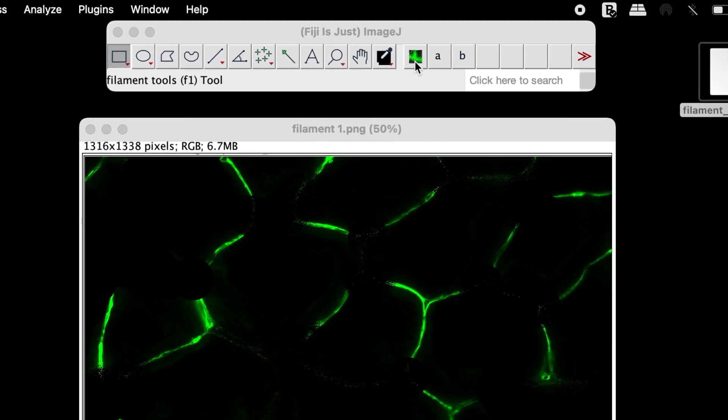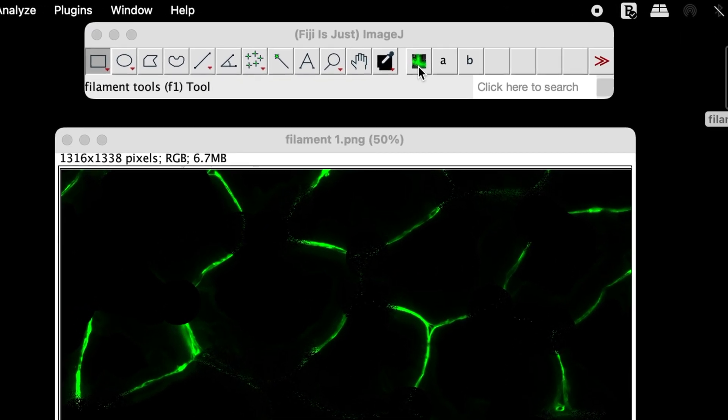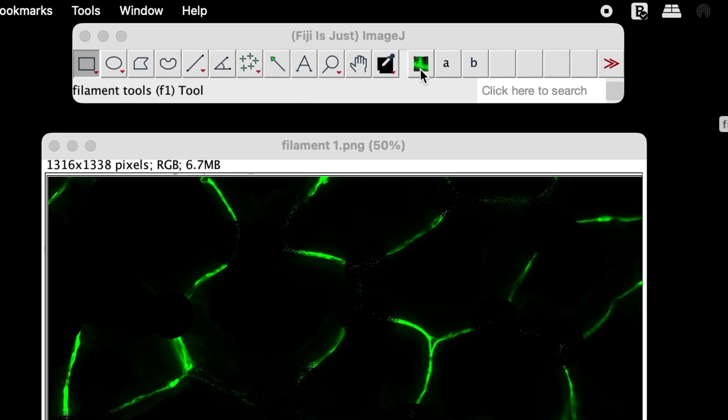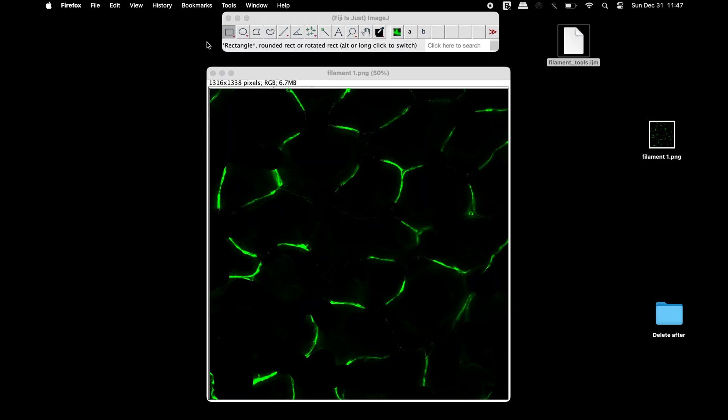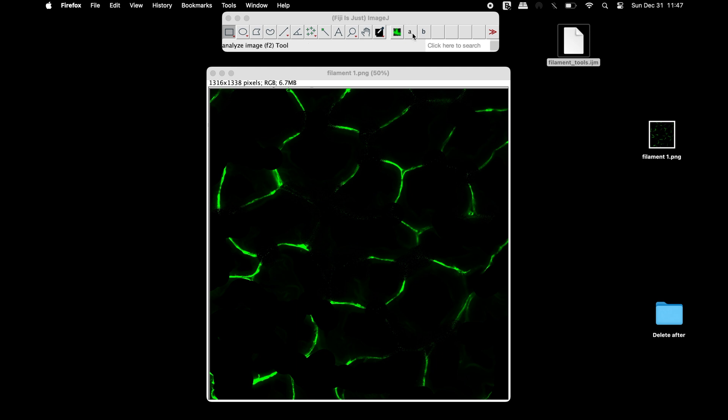The first icon in green leads to the filament tool macro webpage. The second icon, A, allows users to set the parameters and analyze the active image. The third icon, B, allows users to set the parameters and analyze the images in batch mode.